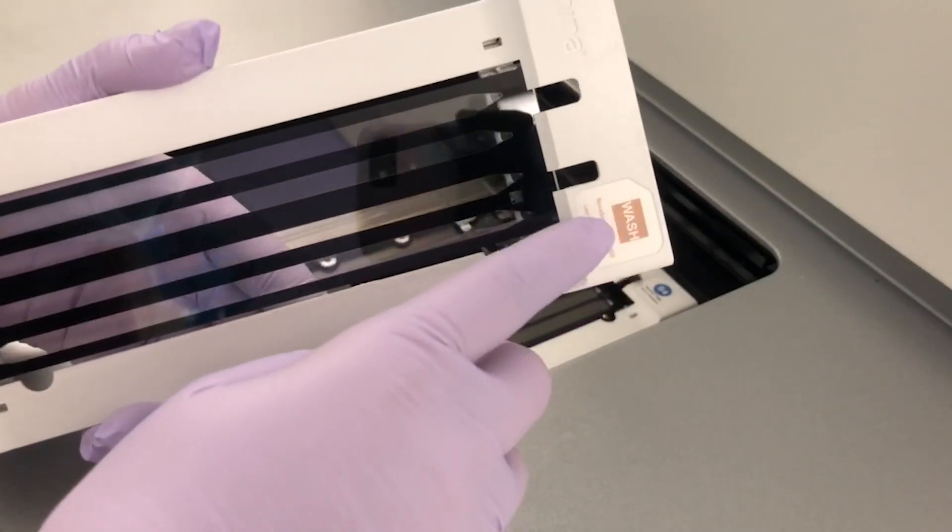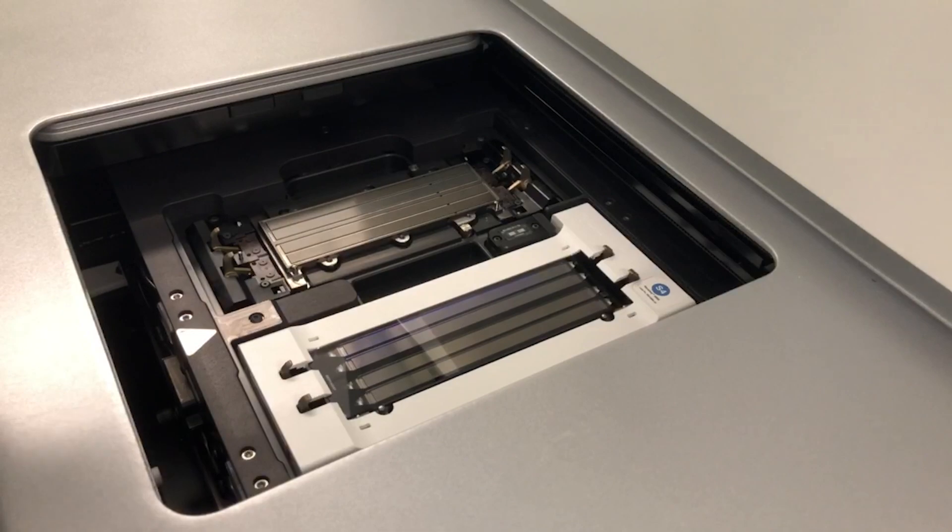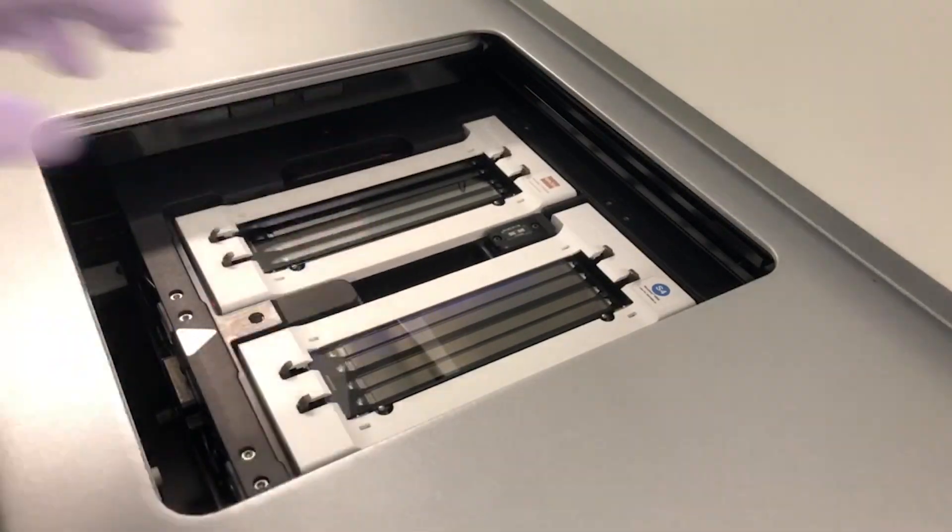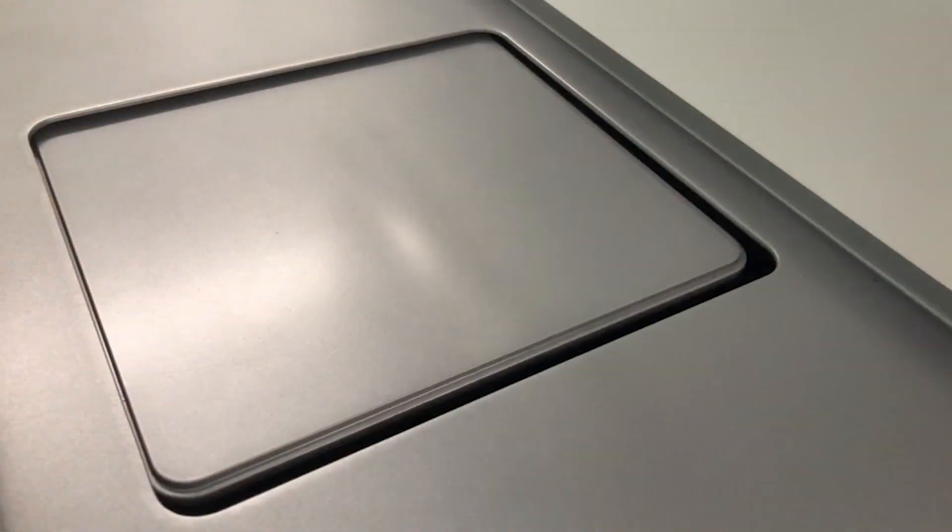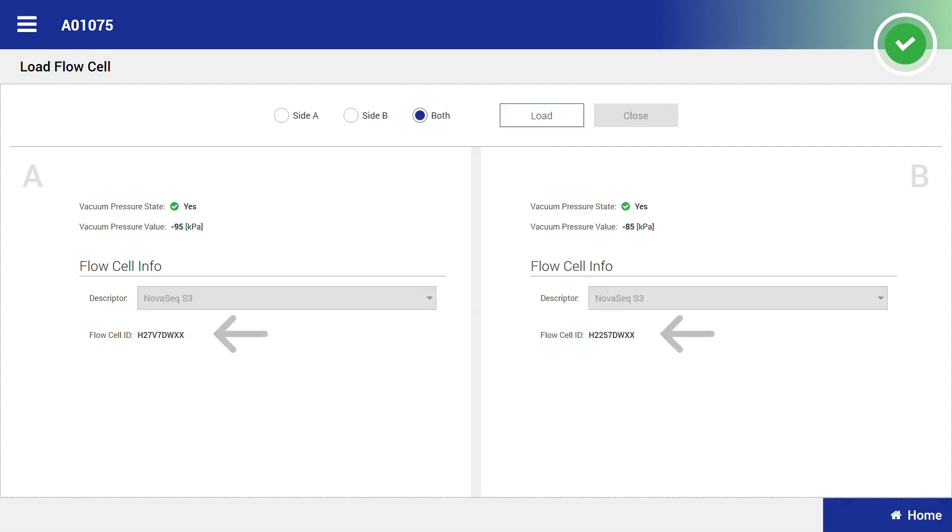After loading the wash flow cells, select close. Once the instrument has recognized the flow cells, a green check mark will appear next to the vacuum pressure state and the flow cell ID will populate.